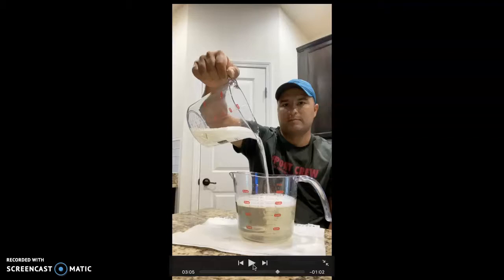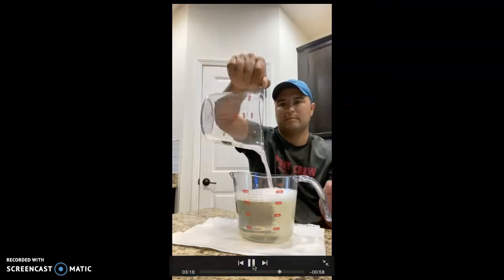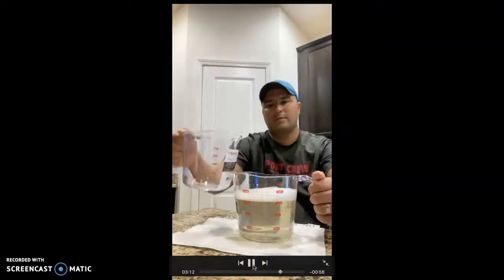The reaction can also be affected by the concentration of the solutes. And if you stir the solution, then it also affects the rate of reaction. What else? I guess that's about it.